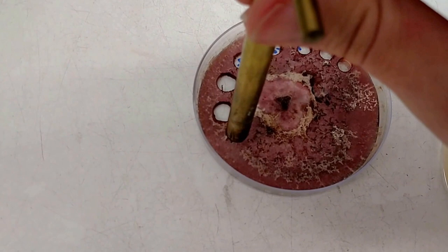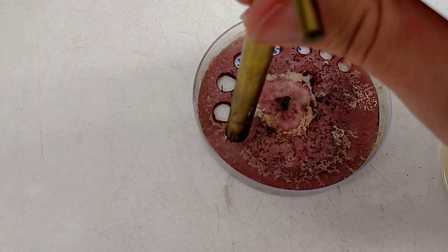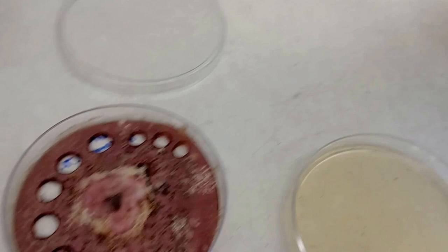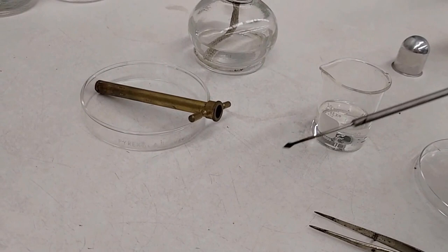So what I'm going to do here is I'm going to get the borer, stick it in the plate into the agar, make a nice little hole. I'm going to put it down and then also I'm going to grab something to pick that little ring up that I just made.